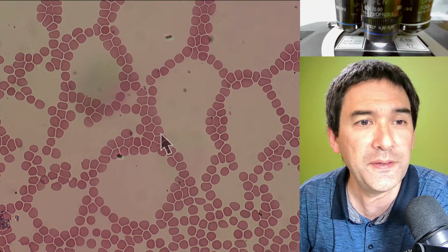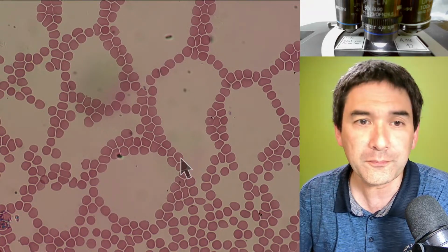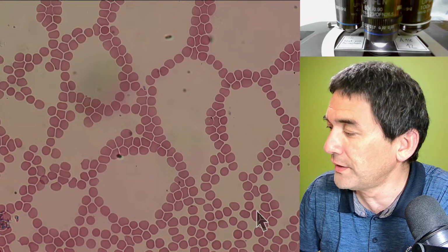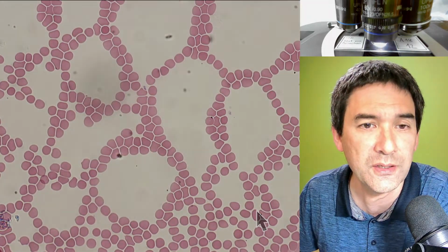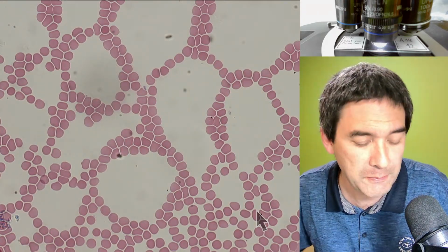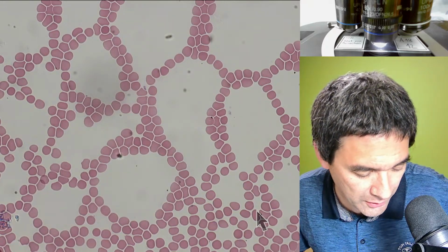This is something that we're going to see a little bit differently right now, using my 60 times objective. Okay, so if I remove the DIC filter, then this is in bright field, and you can actually see that it looks quite similar. We're also able to see a little bit the pinkish, the red blood cells actually look a little bit pinkish. However, there are a couple of other things I would like to show you here.